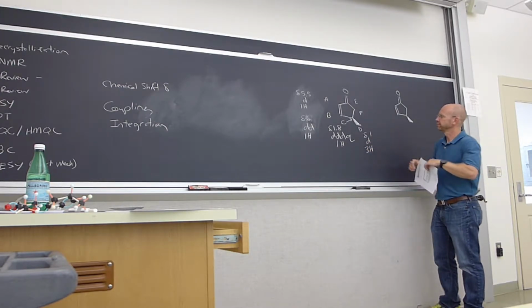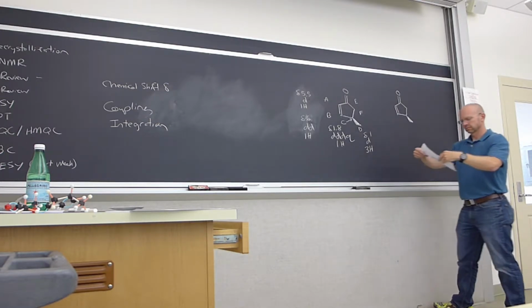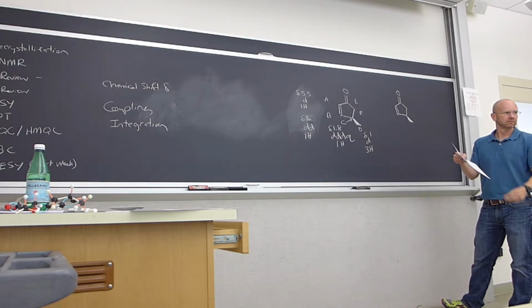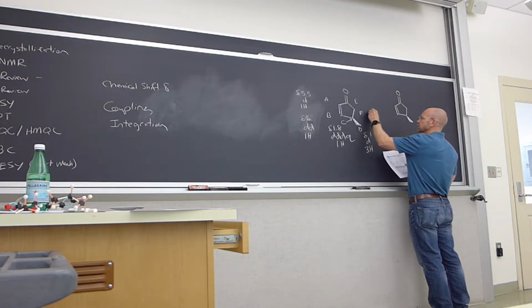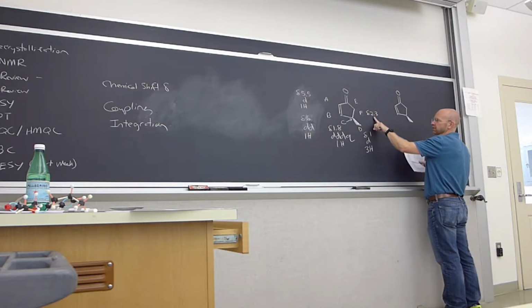How about F? Chemical shift estimate? 3. A proton on a carbon next to a carbonyl. What's the best one in your table? Yeah, it has that ketone one, so that's, yeah, like 2.3. Okay, so 2.3 with the chemical shift, and then how about the splitting?